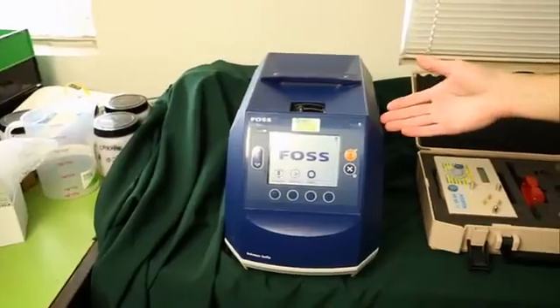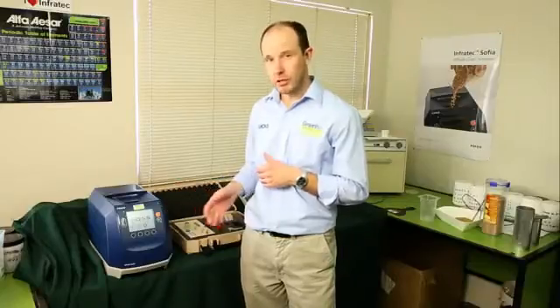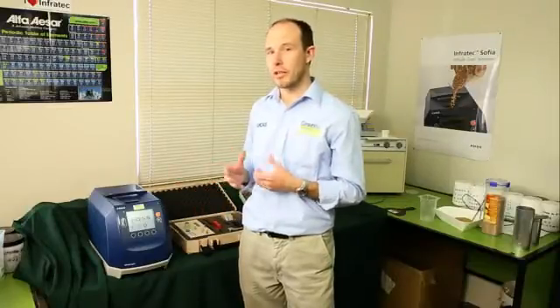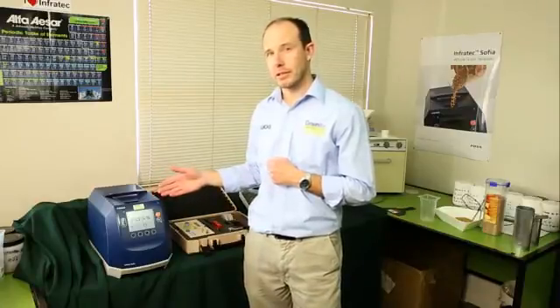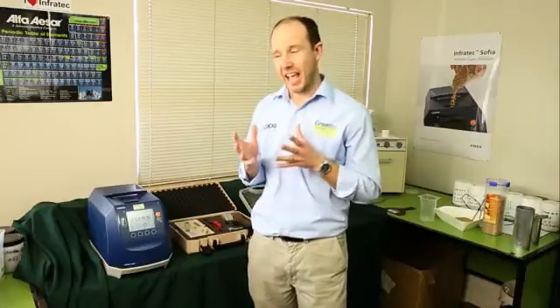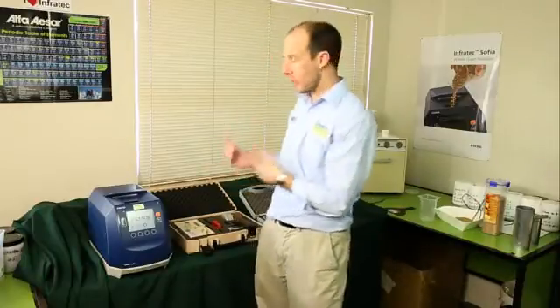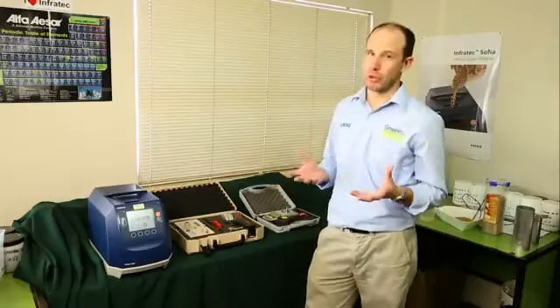Moisture meters like the FOS Infratec SOFIA and the FOS Infratec 1241 use near infrared light to measure the moisture. Because these two meter types use different technologies, they're affected by different things, and the readings that you get between the different types of meters are not always identical.